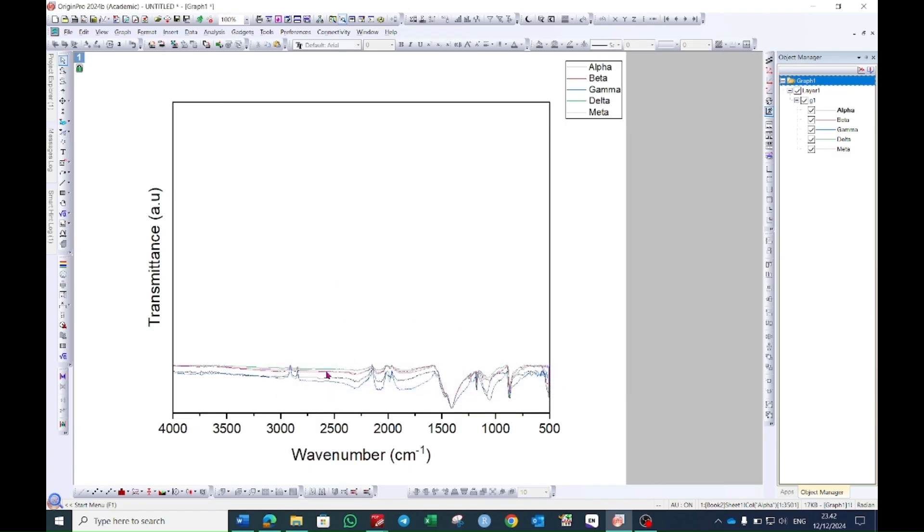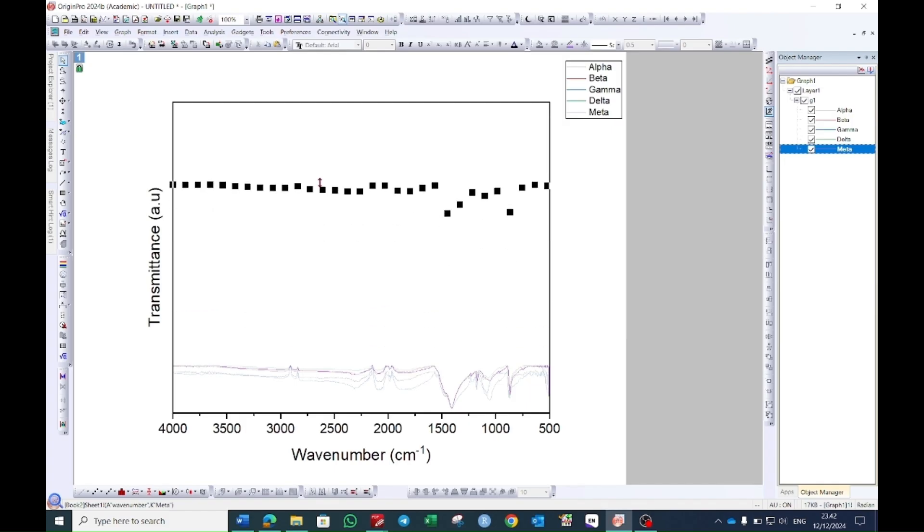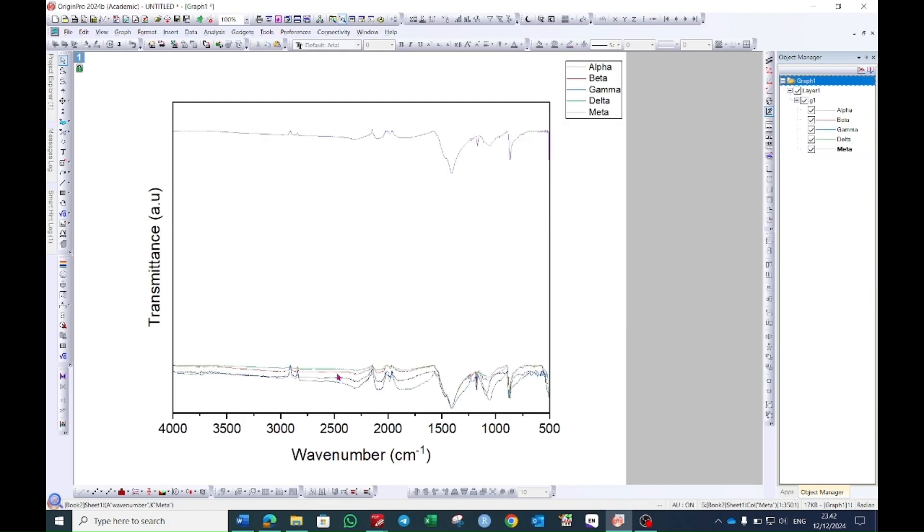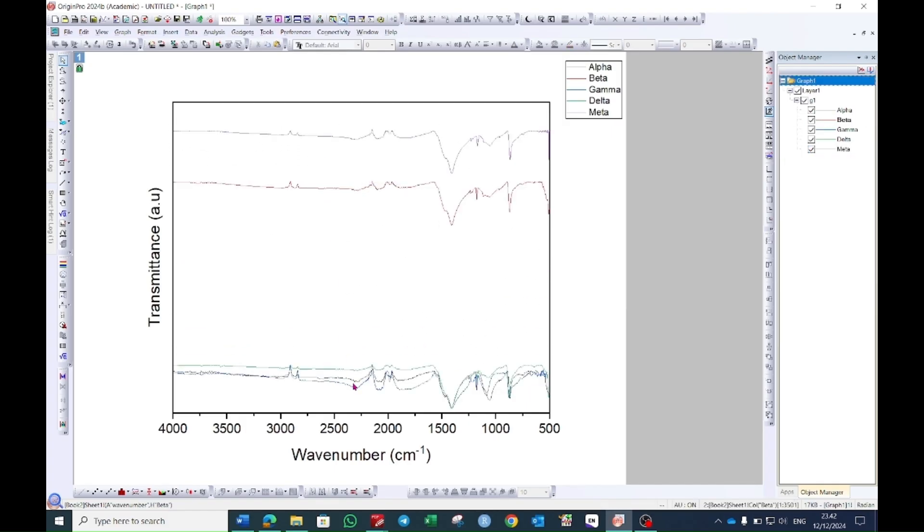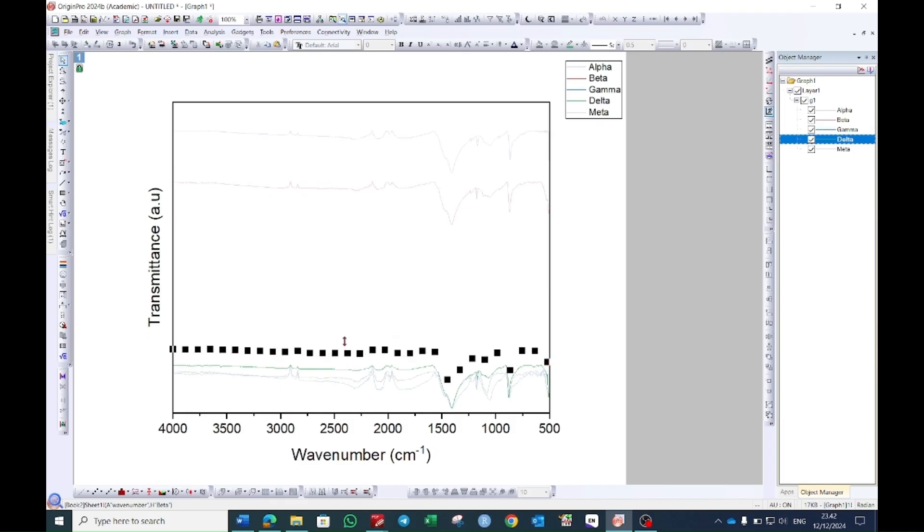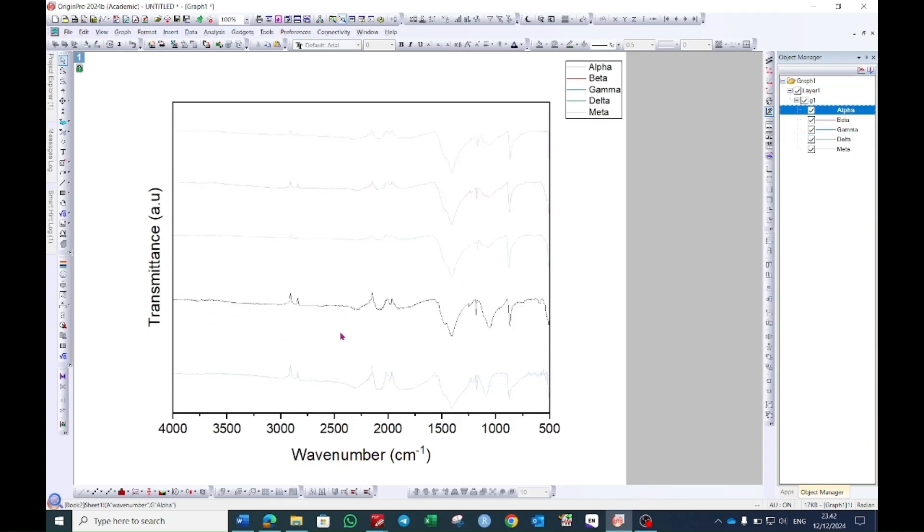Now select layers and drag it to the top. You can do this by selecting one by one and placing it in the graph.